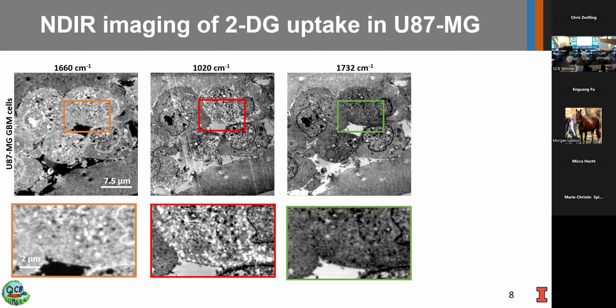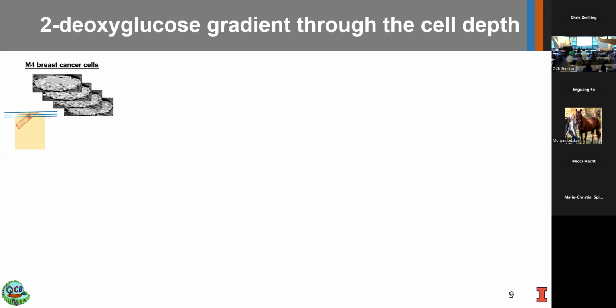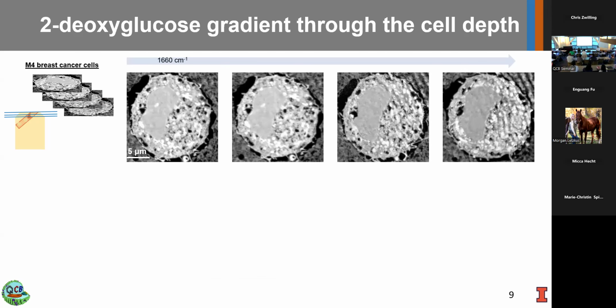And obviously, you can put all these images together with respect to epoxy, and you can get this image where the red color should show you glucose localization. We can go one step further to get serial sections. So instead of just looking at one section, take 8, 10, 15 sections continuously and get images. So this is the first section, second, third, fourth, and so on.